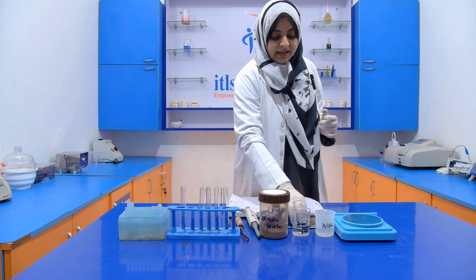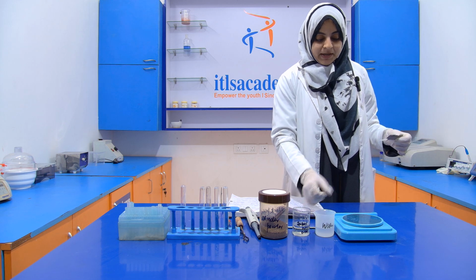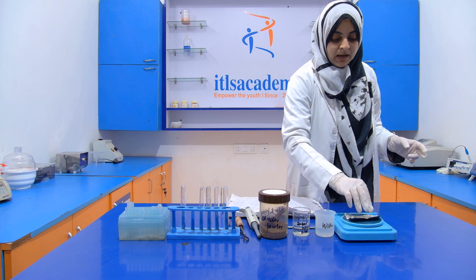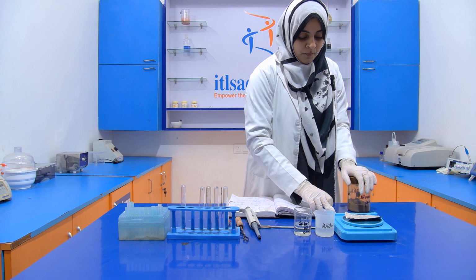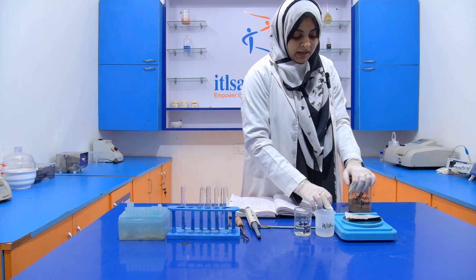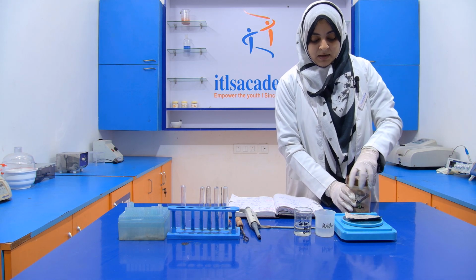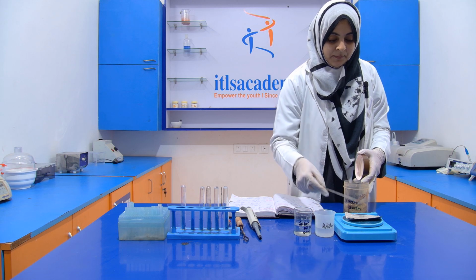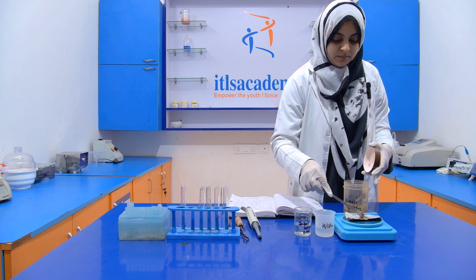Now start the experiment. We have to take the weight of the coriander powder with the help of the weighing balance. Put the aluminum foil on the weighing balance and don't forget to tare the weight of the aluminum foil. Now we have to add 1 gram of coriander powder into the test tube.